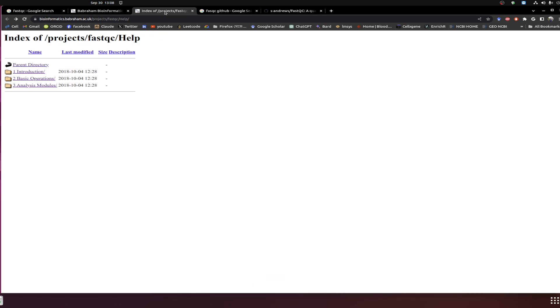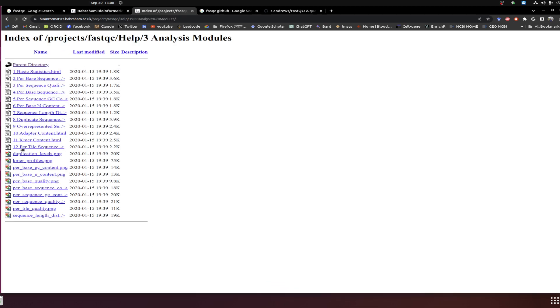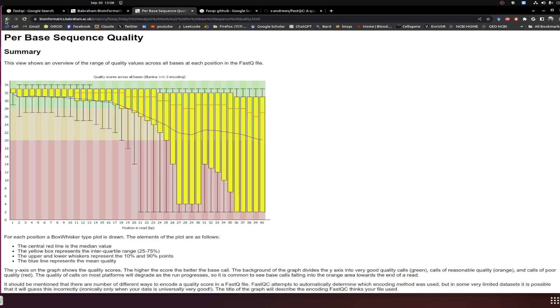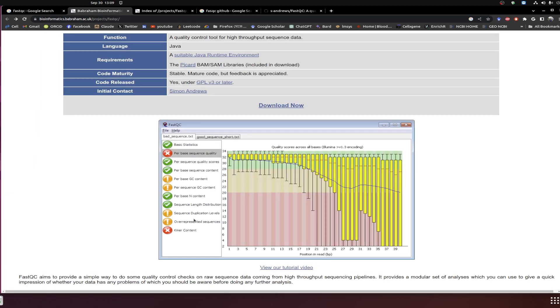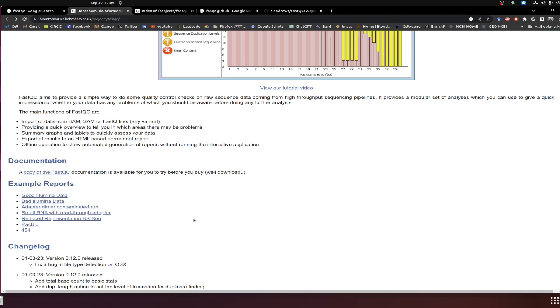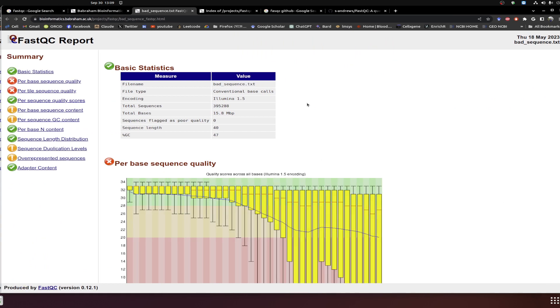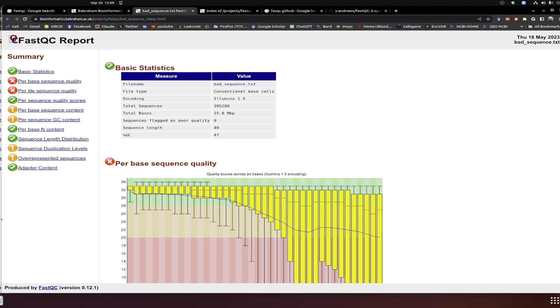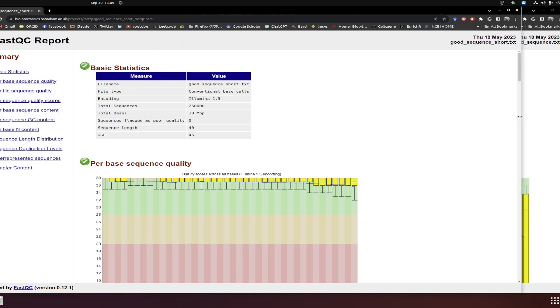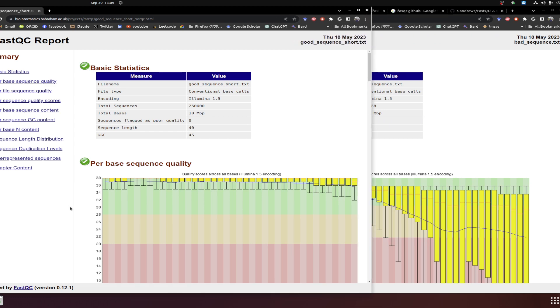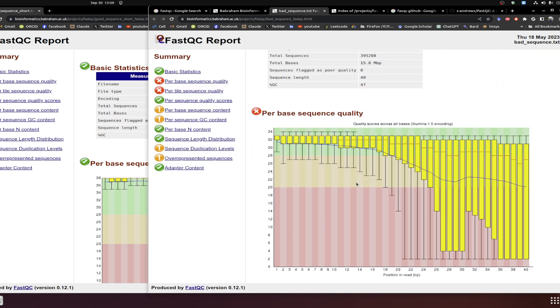In the FastQC tutorial, you can go through the quality metrics such as per-base quality and different sequence details. This tutorial is very well developed. There are two example datasets — one for good sequence data and one for bad sequence data. We need to compare the good and bad datasets side by side to understand how to comment on whether your sequencing is good or bad after analysis.